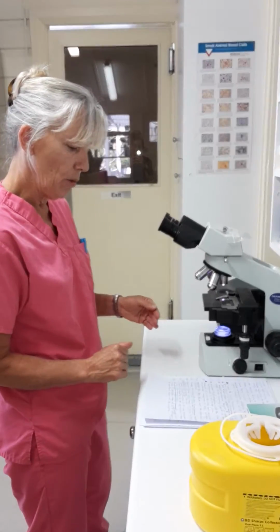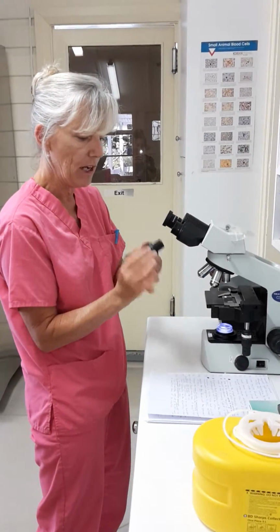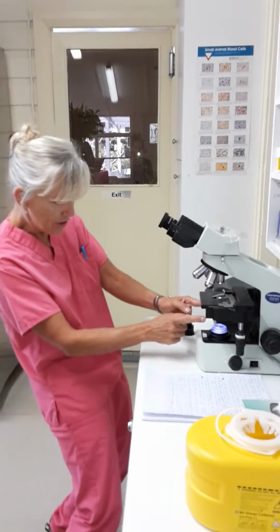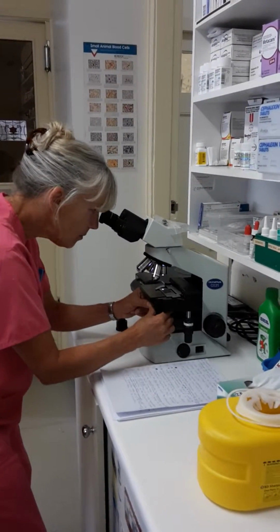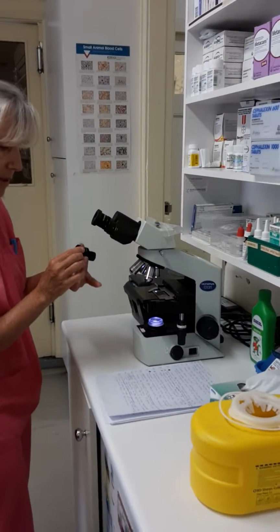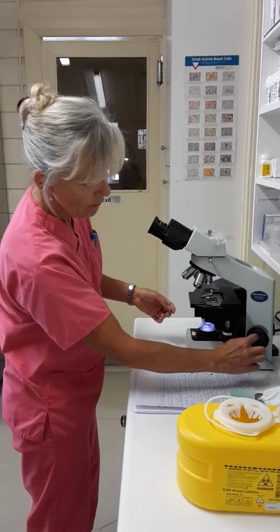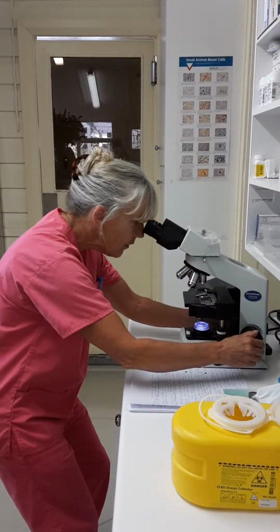The next thing we're going to do is remove one of the ocular tubes, which is what these things are here, very carefully because it's an expensive piece of equipment. We're then going to adjust the condenser diaphragm, which is this part here, to 80%, swiveling it around, and then we're going to replace our ocular back into its spot. We're then going to adjust the fine focus until the specimen is in view. The fine focus is this smaller one again. So we're adjusting that nicely.